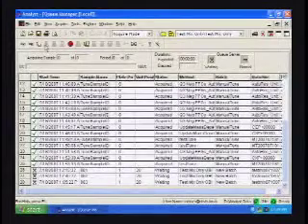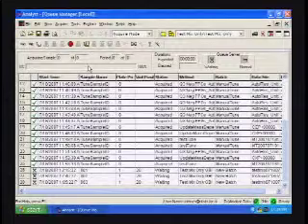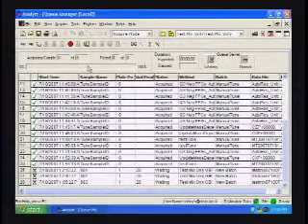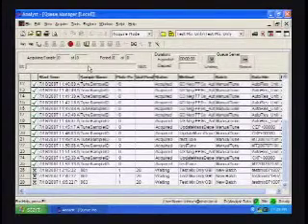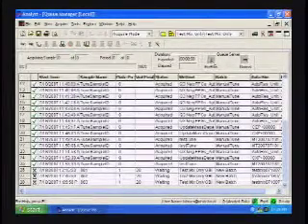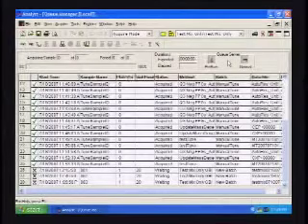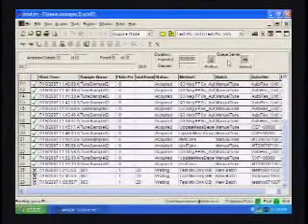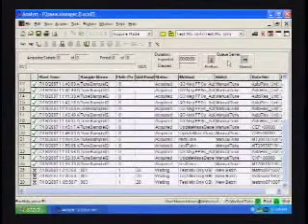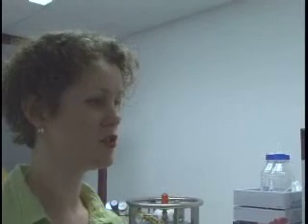You can also see on the queue right here, on the right hand side, it's got the queue server boxes. And it now says that it's in a pre-run. Previously, it told us that it was in standby and also ready when we activated it. So not only can you use the icons at the bottom, but you can also use the queue server status at the top.